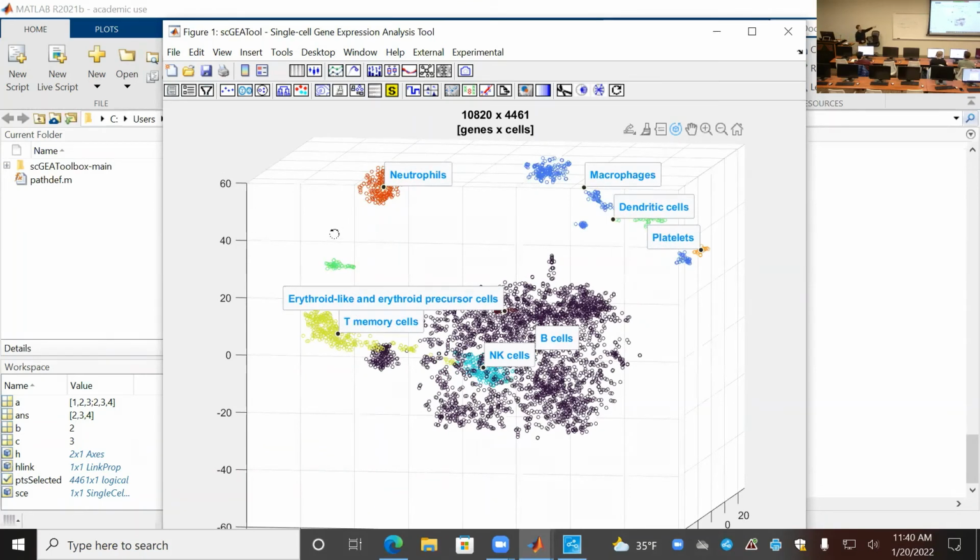Remember the neutral file we talked about. I think the correct annotation is there. So what's the next step?